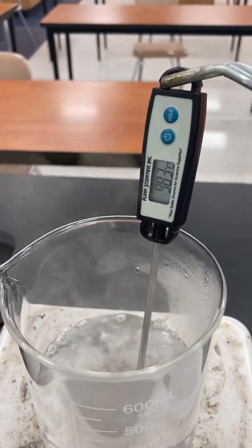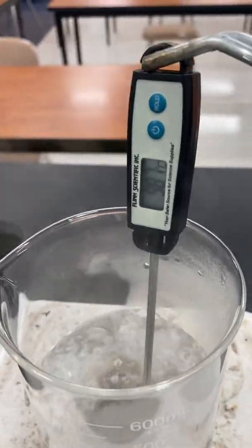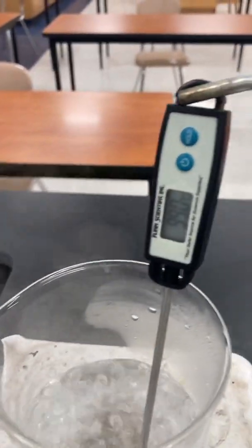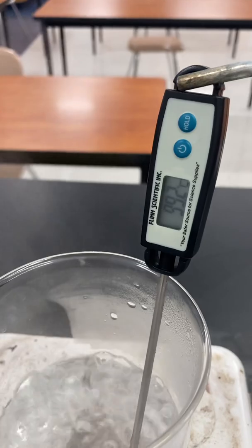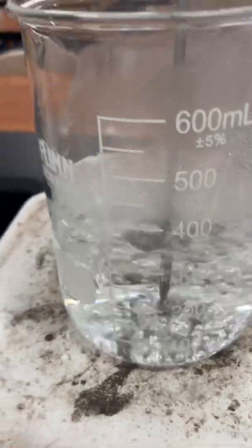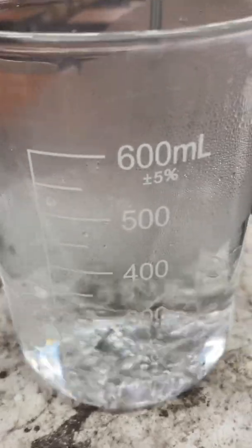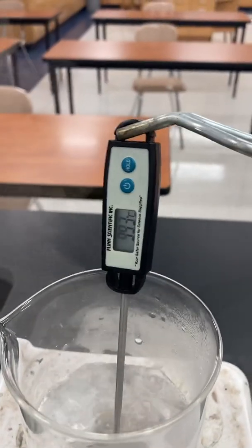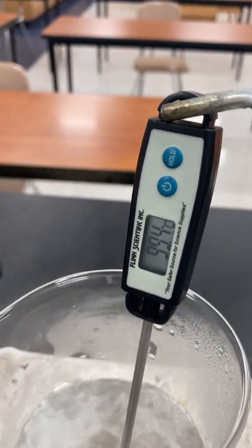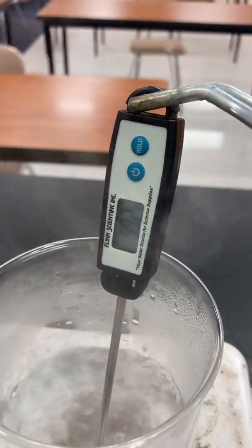Okay, remember, there can just be flaws in these thermometers too. These thermometers might not be perfect. What I really want to see here, okay, at 12 minutes, we are at 99.2 degrees Celsius. Okay, now check this out. Now it looks like bubbles are forming from everywhere inside of this beaker. This is true boiling now. You know, we're at 99.3, 99.4. Now check it out. Is my temperature really going up anymore?